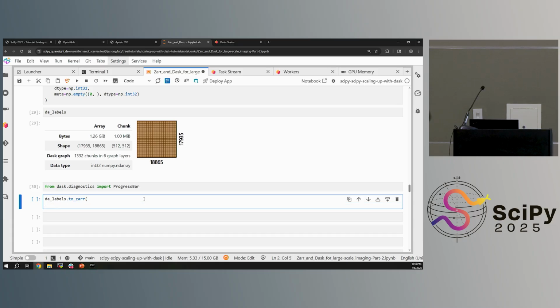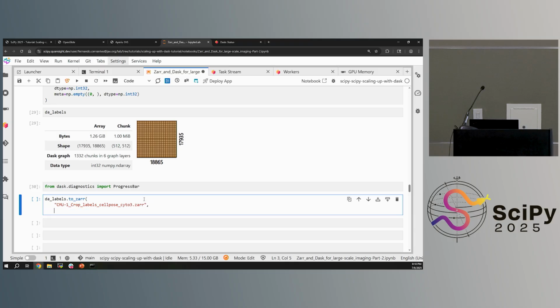The cell indication vectors are really just the same. Okay, exactly, gotcha. This is more like quicker processing, I guess. By showing it this way, you just see that particular object, but you don't have the pretty overlay. But at the end of the notebook, we do the overlay again. So here it is again. So we go back and forth. I think it's about what do you want to look at, essentially.